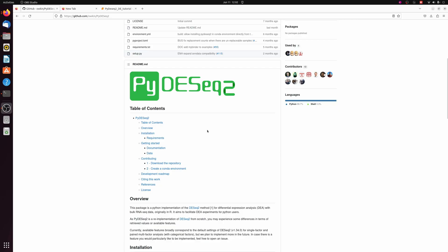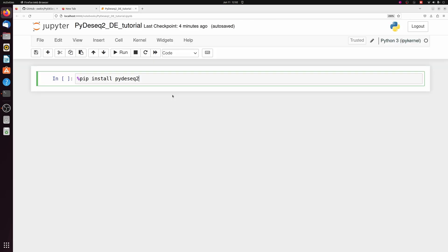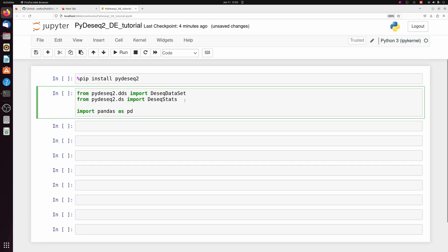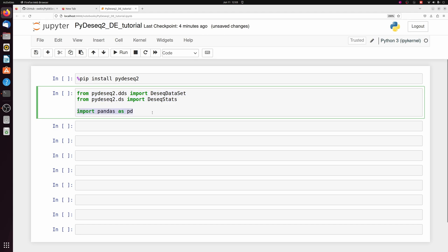So we're going to be doing bulk differential expression using PyDseq2, which is a re-implementation of Dseq2 which is normally run in R, in Python instead. So we can do this whole analysis in our Jupyter notebook. You can install PyDseq2 like this, and we're going to import the modules from it that we need, as well as pandas for some data frame manipulation.